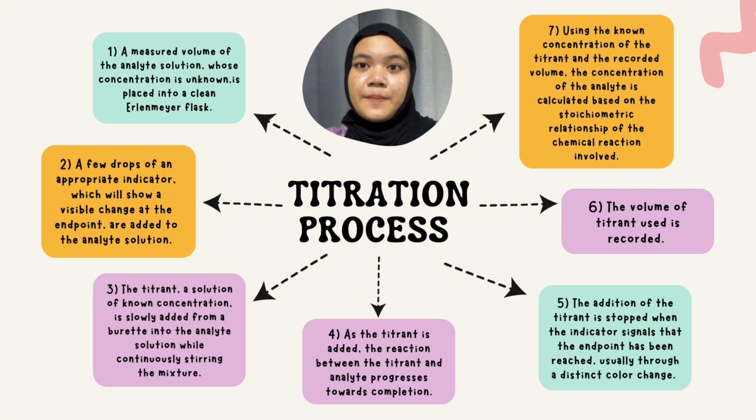For the third step, the titrant, a solution of known concentration, is slowly added from a burette into the analyte solution while continuously stirring the mixture. The fourth step, as the titrant is added, the reaction between the titrant and analyte progresses towards completion. For the fifth step, the addition of the titrant is stopped when the indicator signals that the endpoint has been reached, usually through a distinct color change.